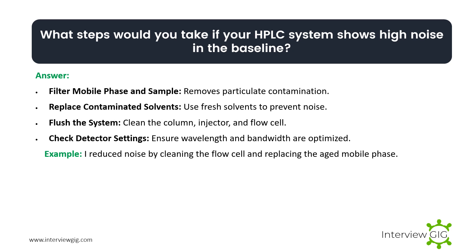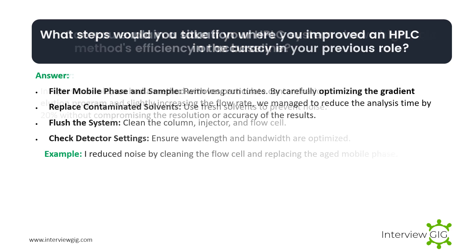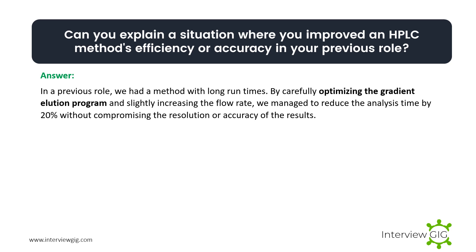What steps would you take if your HPLC system shows high noise in the baseline? Filter mobile phase and sample to remove particulate contamination. Replace contaminated solvents — use fresh solvents to prevent noise. Flush the system and clean the column, injector, and flow cell. Check detector settings — ensure wavelength and bandwidth are optimized. Example: I reduce noise by cleaning the flow cell and replacing aged mobile phase.